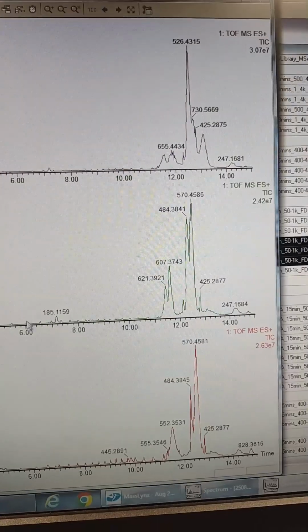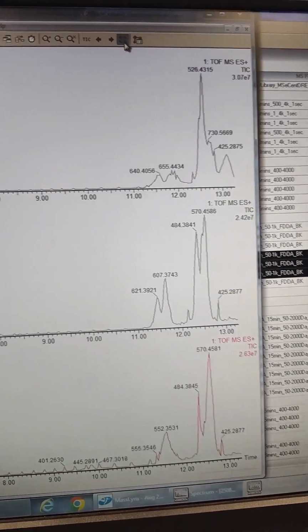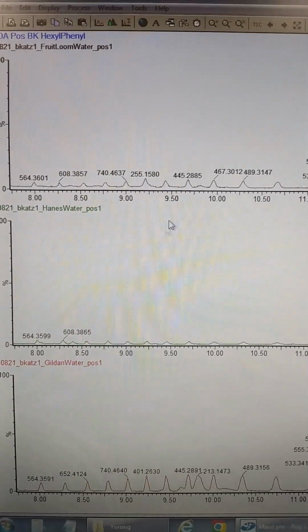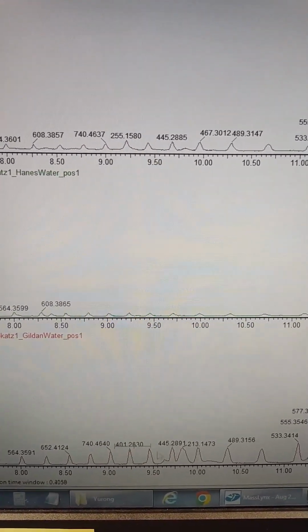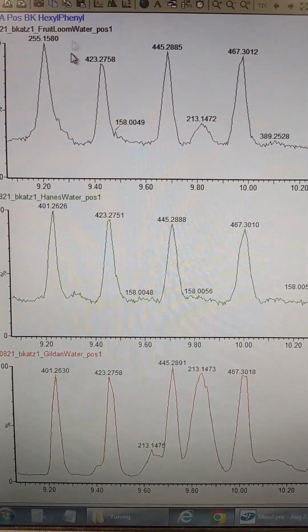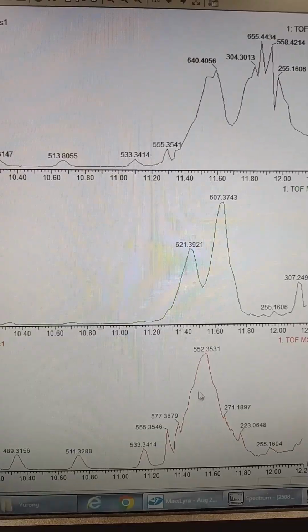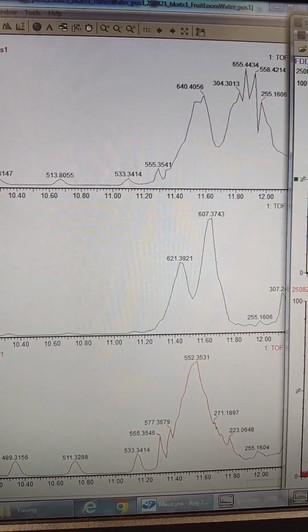I don't have a great database for these types of stuff. And then if we look later out maybe here, you can see that we have the spiky polymer pattern, and then we have a unique molecule that's kind of coming out right here that's only in the Gildan, maybe a little bit in the Fruit of the Loom, but not in the Hanes. All right? And then out here in the most nonpolar region, we got maybe a blob, and then some other moderately large things.